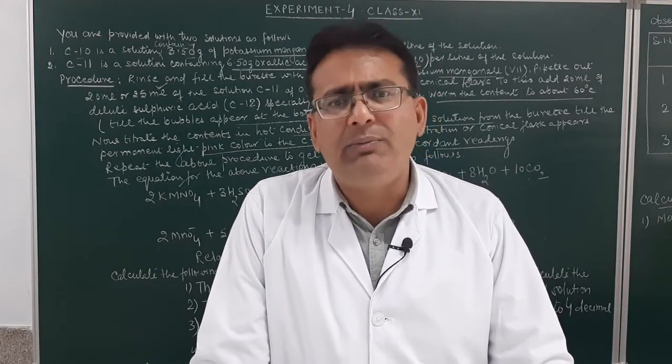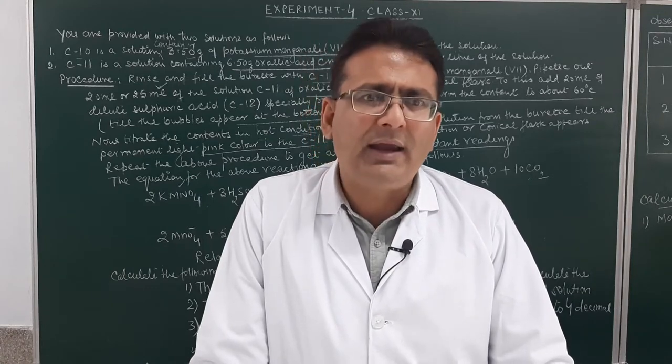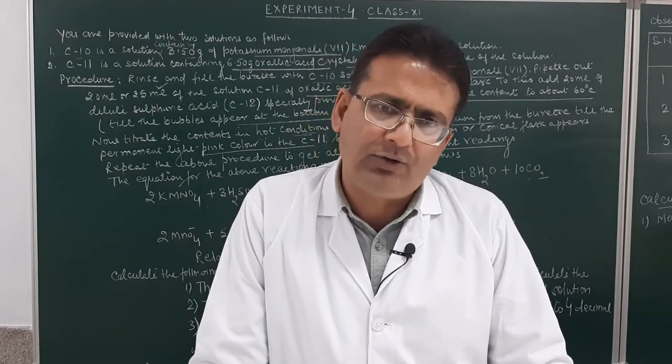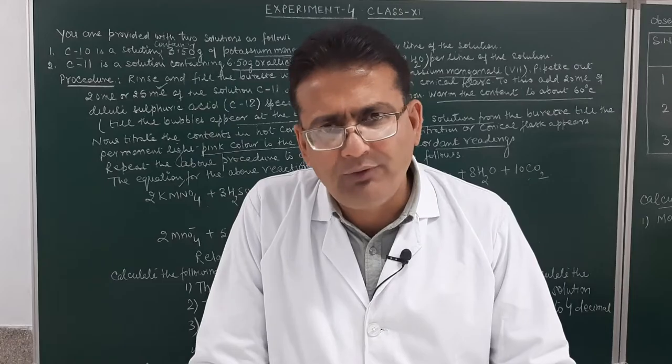Now again I will be demonstrating the same to you so that you may understand how to obtain the titer value and how to go for the calculation. So we will now demonstrate the titration for experiment number 4.